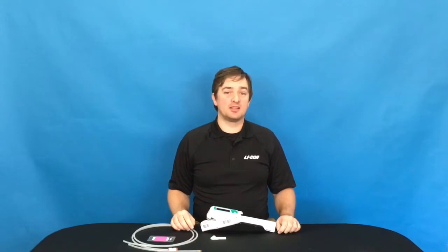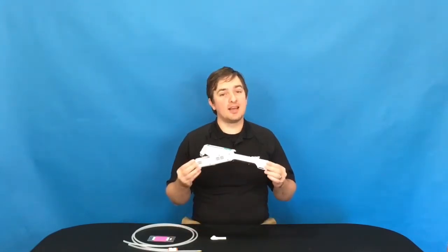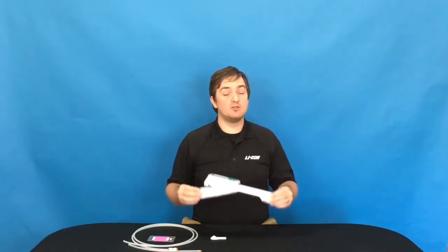I'm Eric Price with LI-COR Biosciences. Today I'm going to show you how to calibrate the LI-600 Porometer fluorometer. Specifically, how to zero the instrument, telling the relative humidity sensors to read exactly 0 when they're seeing dry air.